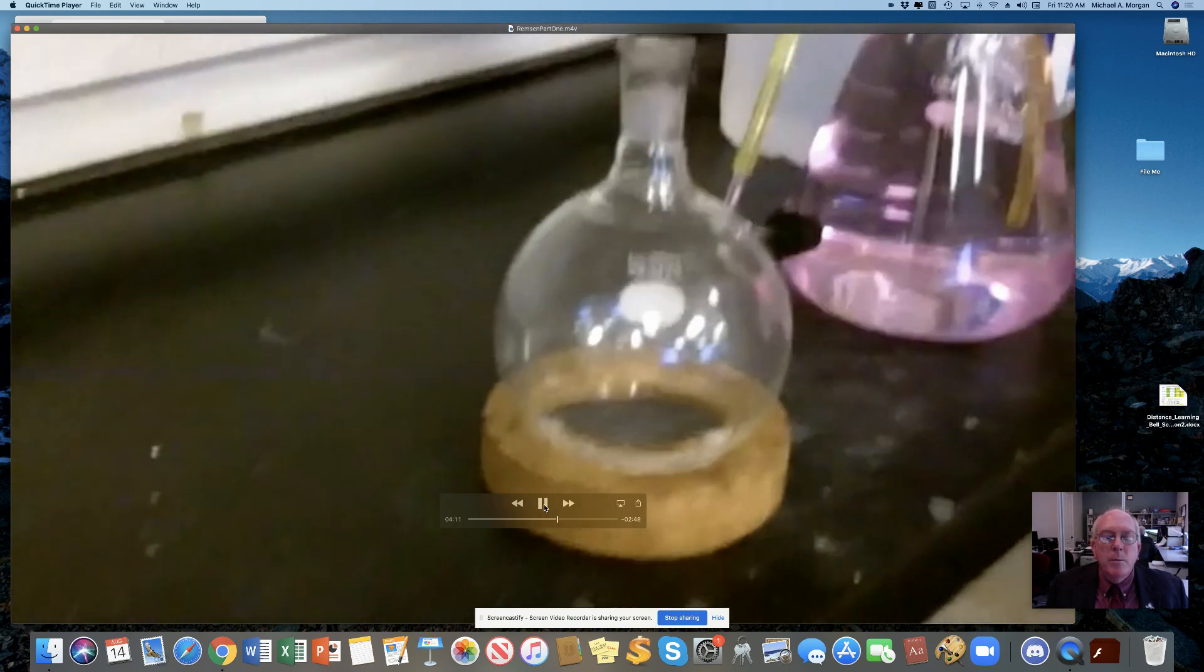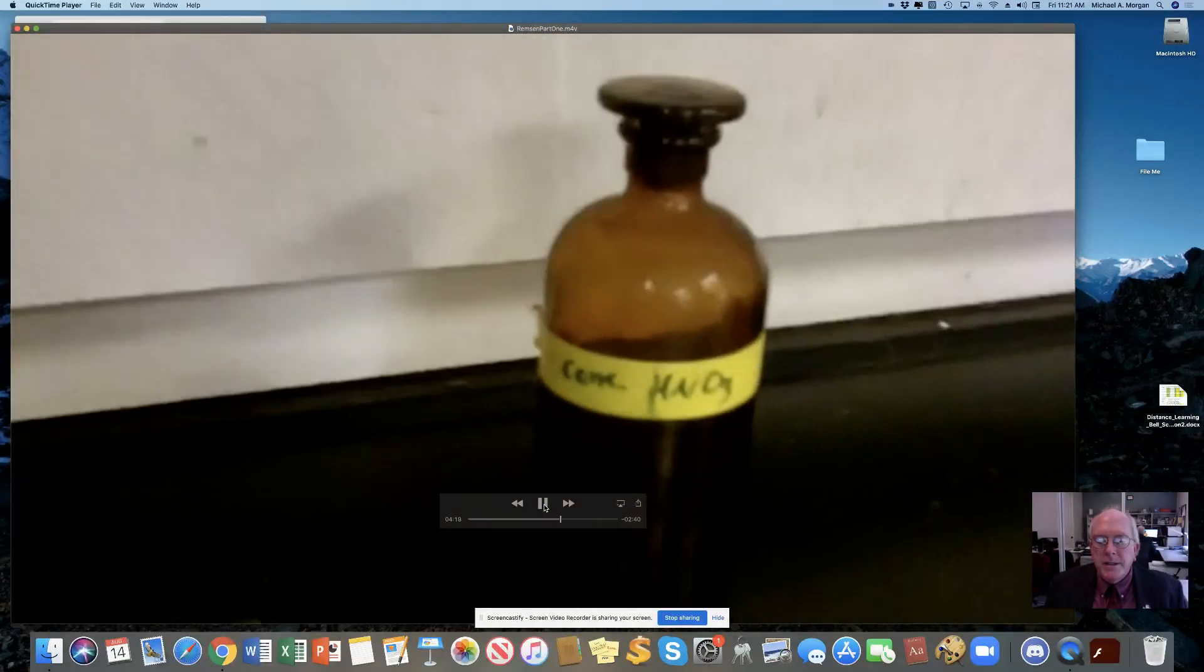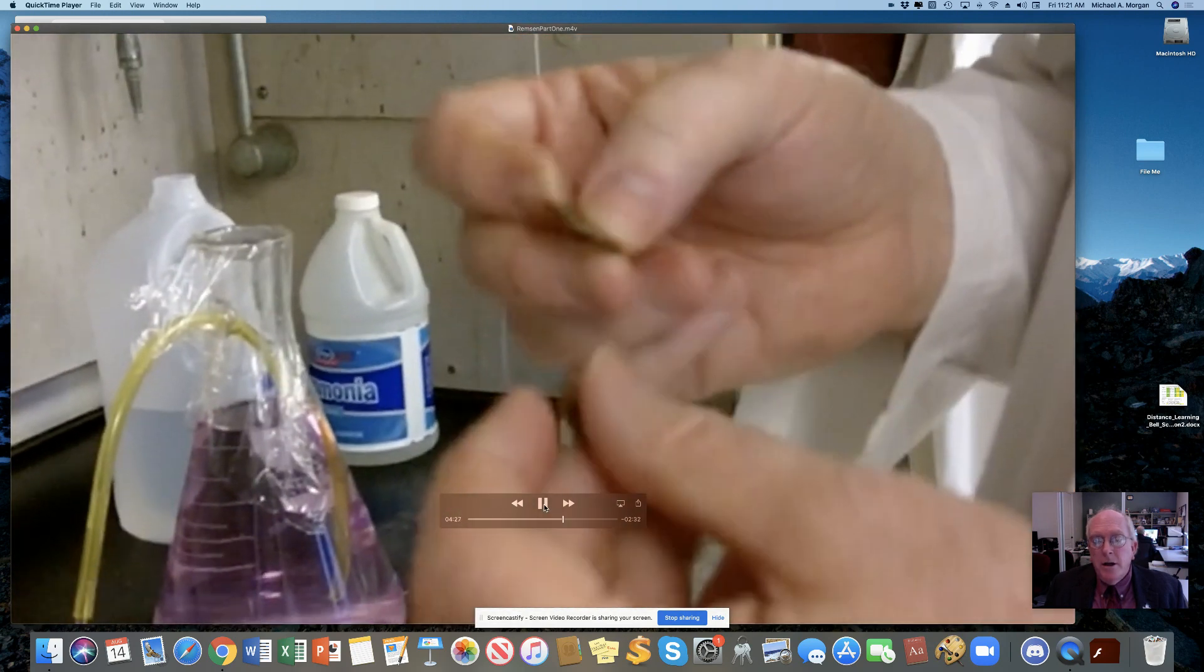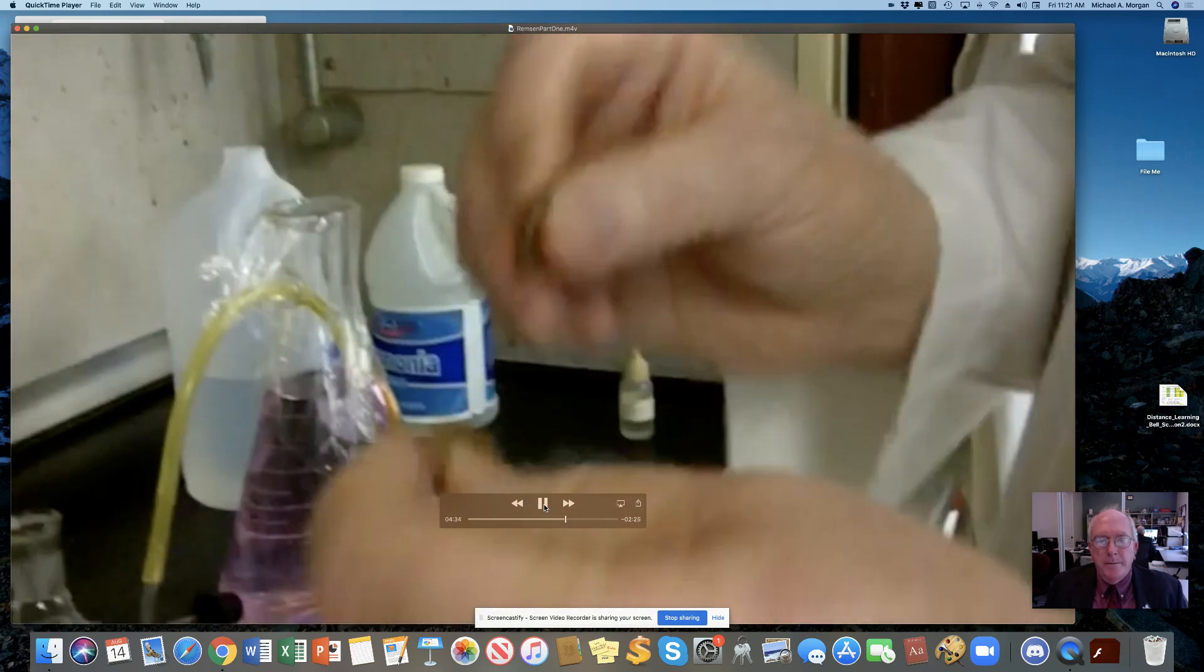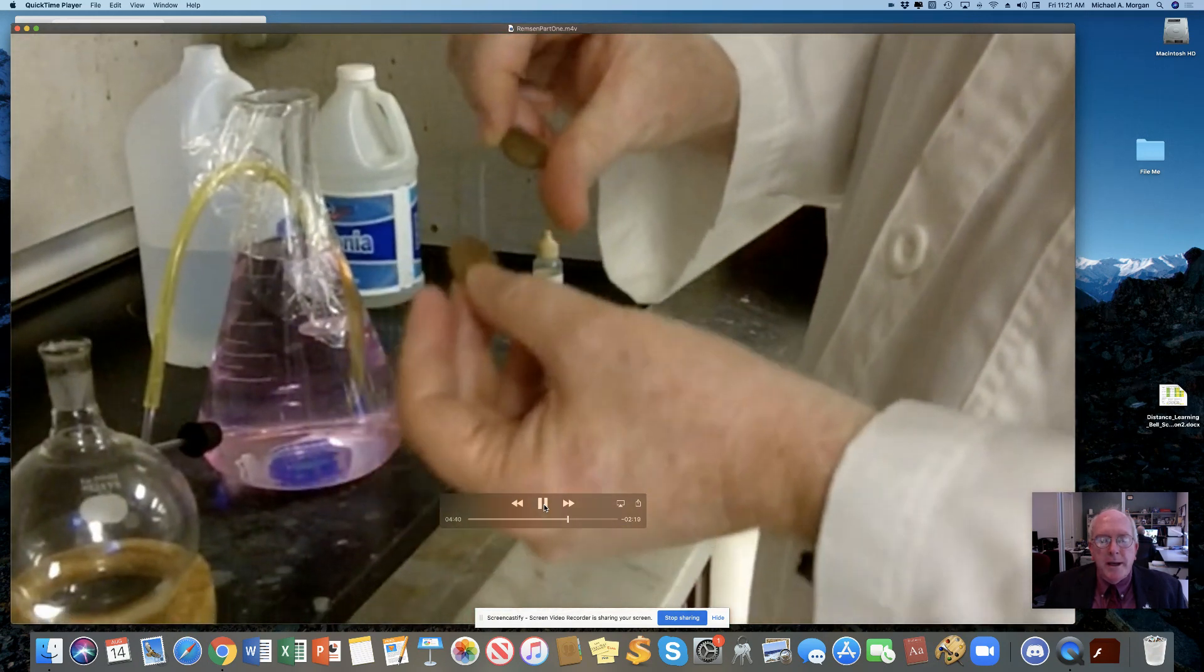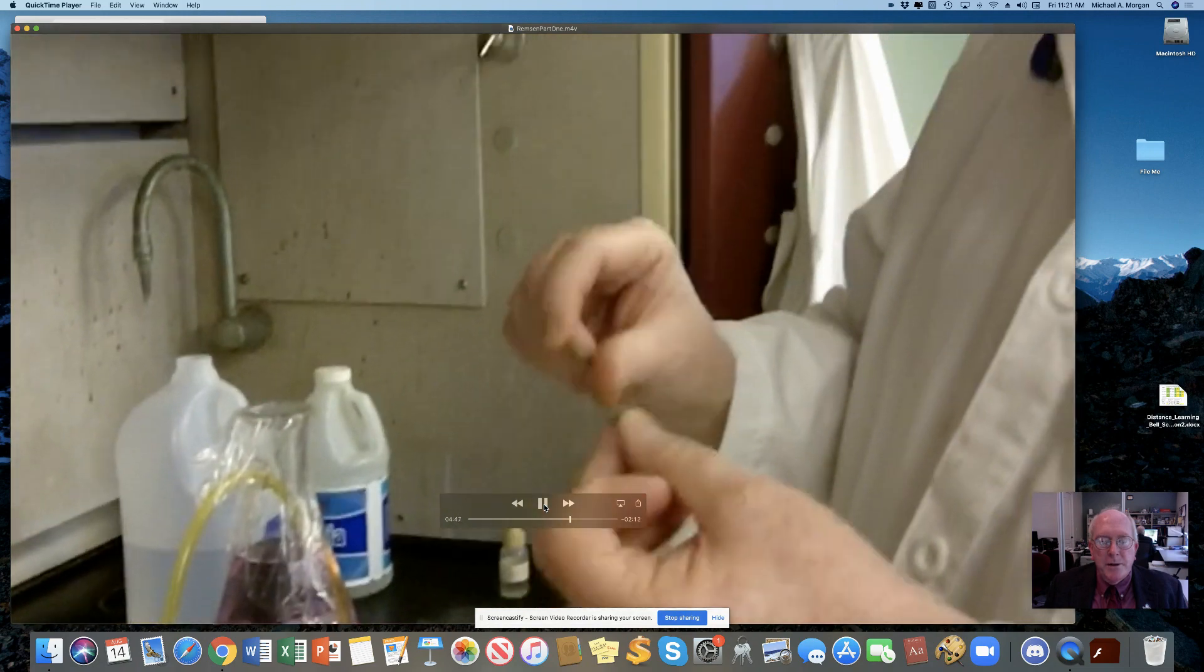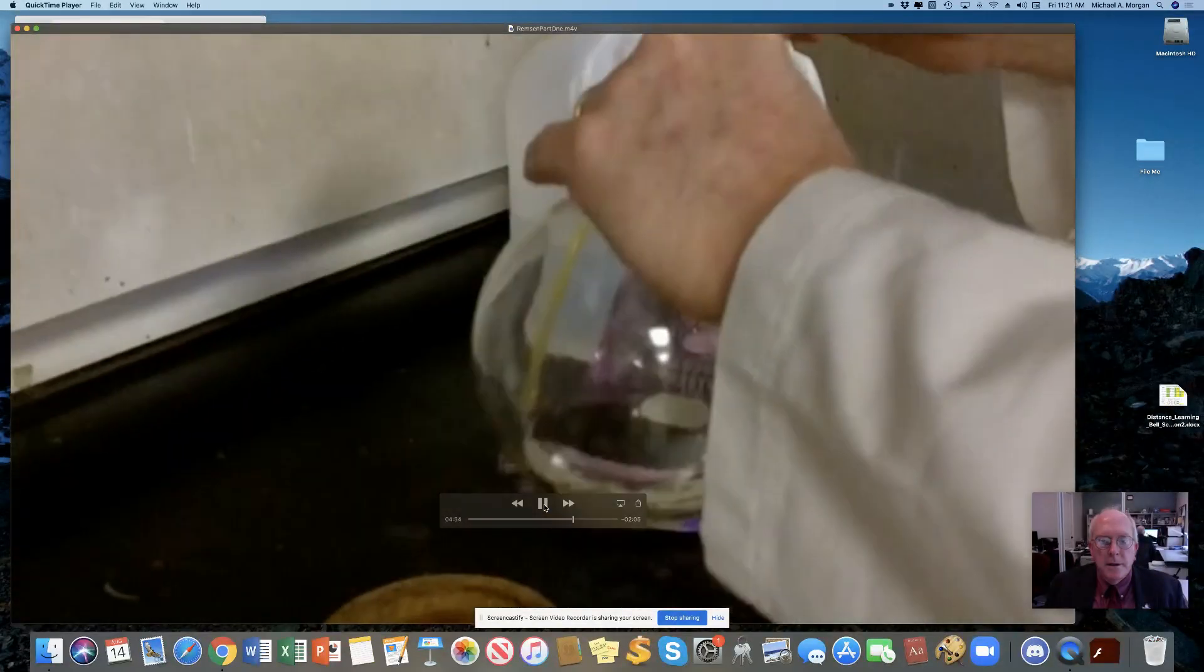Let's take a minute and watch what goes on here as that happens. The two pennies that I've got there are older pennies. They're from before 1982, so that they are 95% copper and 5% zinc. Currently, minted pennies are the reverse. They're 95% zinc and 5% copper. So we want the purest copper that we can. So those two pennies are going to go into the flask, and then we are going to stopper up the flask so that nothing can escape from it. Practice safe science wearing my goggles. Drop those pennies in.